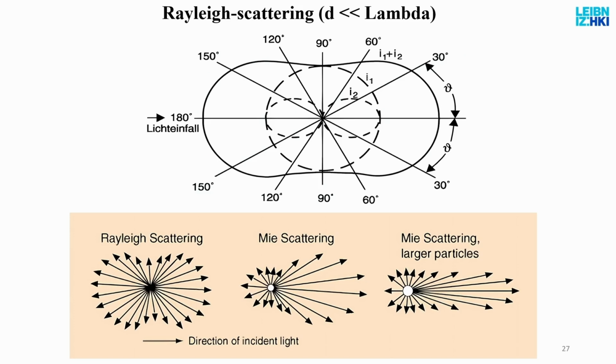Another problem that ruins your images is scattering, light scattering. This basically means that when the photon, the light, arrives at a small, nanometer-size object, for example individual molecules or clusters of molecules, or something larger, like 100 nanometers or micrometer size, like dust particles, it will not continue straight. It will scatter in space.